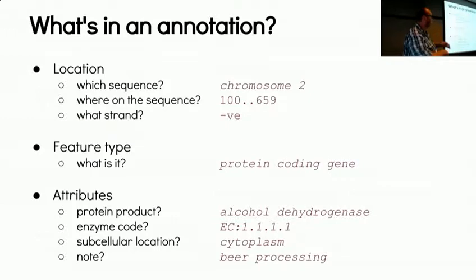feature, the feature includes those positions. Has anyone ever used bed files? Yeah, so they use a different kind of coordinate system. It's not one-based. So some different coordinate systems are used, but here I'm talking about one-based, where position 100 is in the annotation.